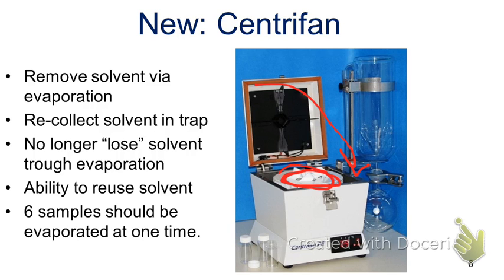So as it's spinning, what it's trying to do is wash solvent up onto the sides of the container. Why would that be important? What does that do? Kind of related to heat getting in, but not quite. Maximizes surface area. Okay? The more surface area there is, the faster it'll evaporate. Okay? So as we spin it, we'll maximize that surface area and increase our evaporation rate.